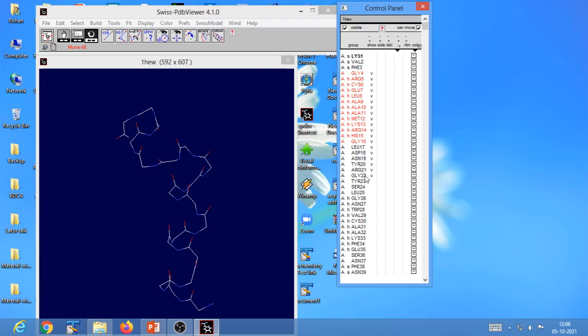Now if you drag too far, say for example, our objective was to only drag till 22, and by mistake you have dragged too far till tryptophan 28. What you can do is simply click individually on the check marks and make your view as you want. You can do one at a time as well.